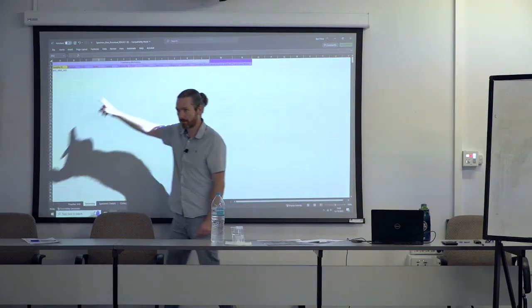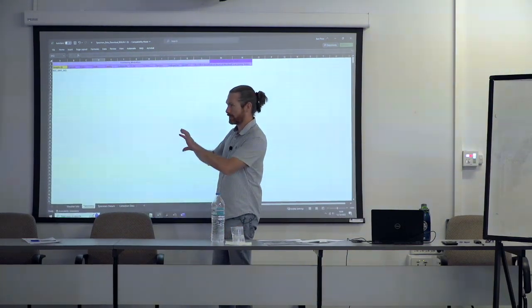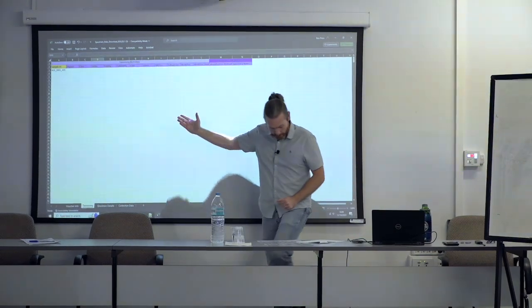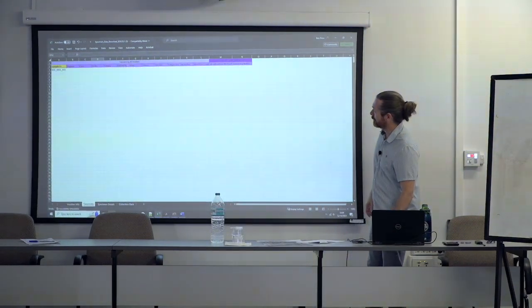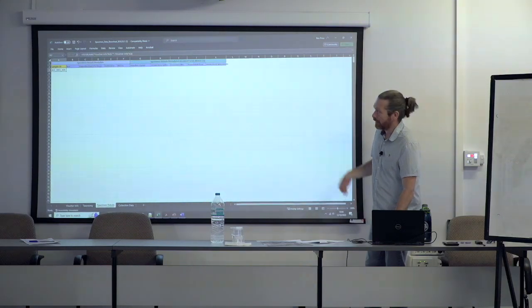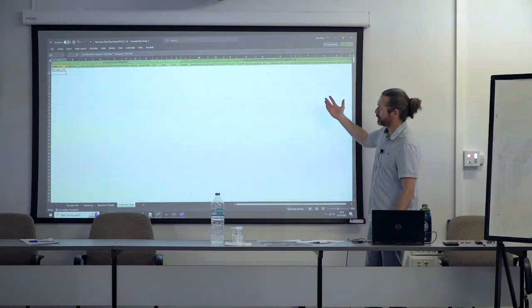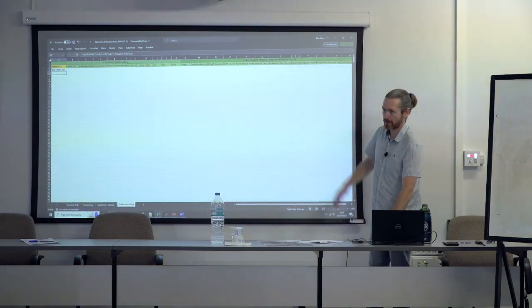It didn't used to do that before, which is a bit of a nightmare, because you can imagine in Excel copying and pasting. This is the taxonomy one. And the specimen details and the collecting information for that. These are not all mandatory. As I said, there's only about 5 mandatory fields.